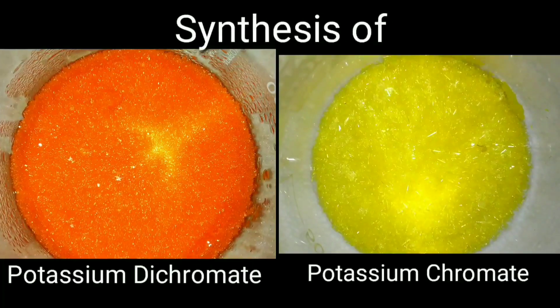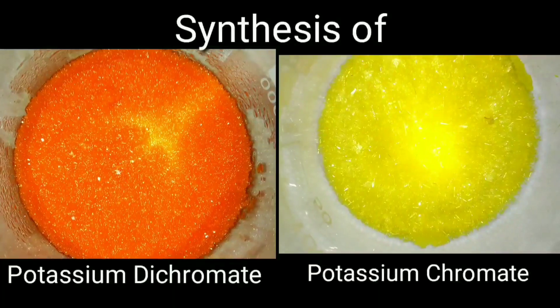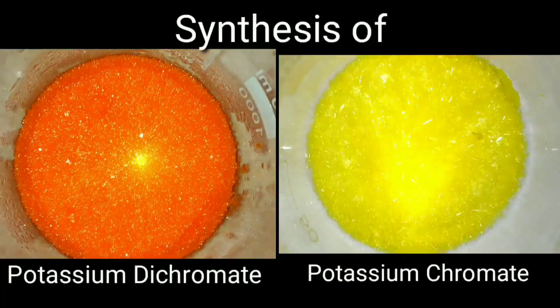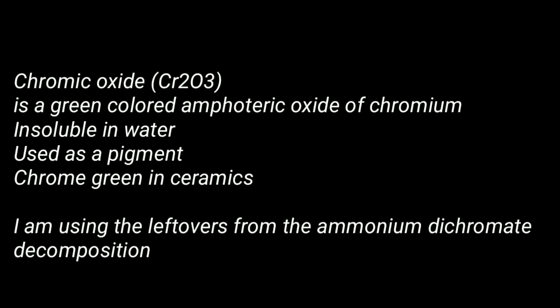Hello friends. Today we will be synthesizing potassium chromate and dichromate from chromic oxide. Chromic oxide is a green fluffy powder available as the chrome green pigment in pottery supplies. I am using the leftovers from the ammonium dichromate video which I had posted like one week back.